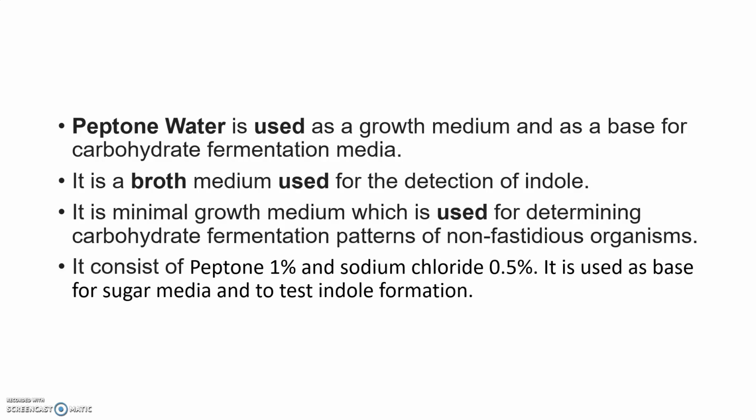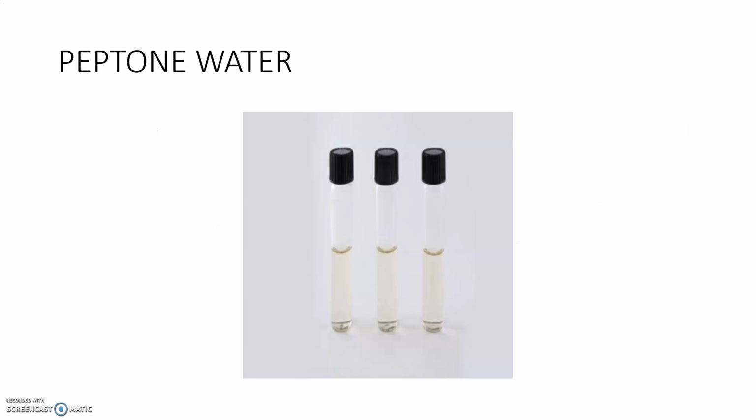It is used as a base for the sugar medium and to test indole production. So this is the picture of peptone water. It can be clear.